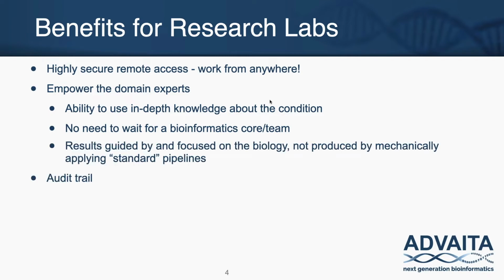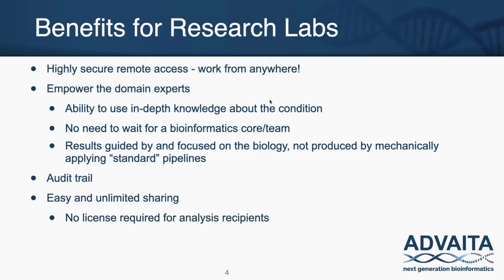interaction. And it also means that your results are guided by and focused on the biology rather than produced by mechanically applying standard pipelines. We provide an audit trail so that you always know what versions of the databases were used for every single inference. And you can always go back to older versions as needed. There's easy and unlimited sharing, which means you can forward your results on to a collaborator across the world and ask them to weigh in.